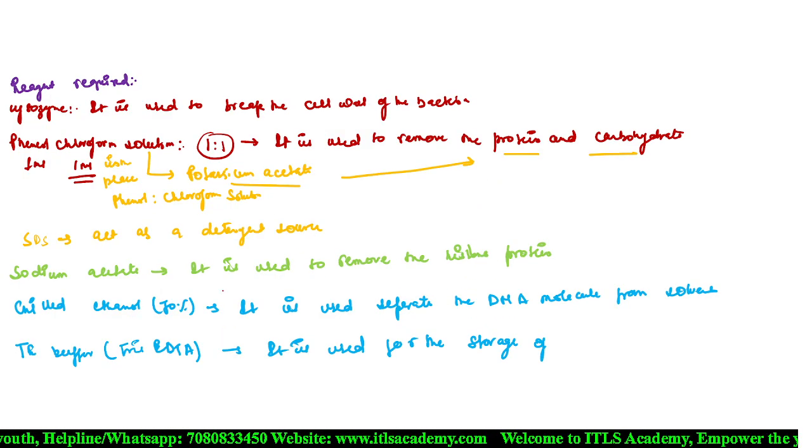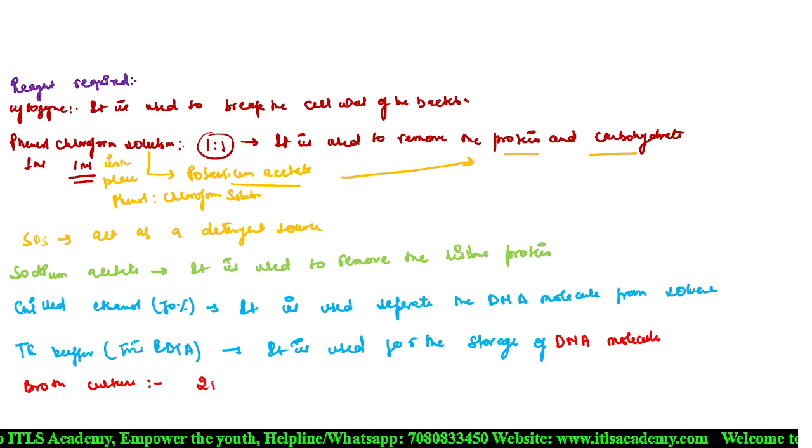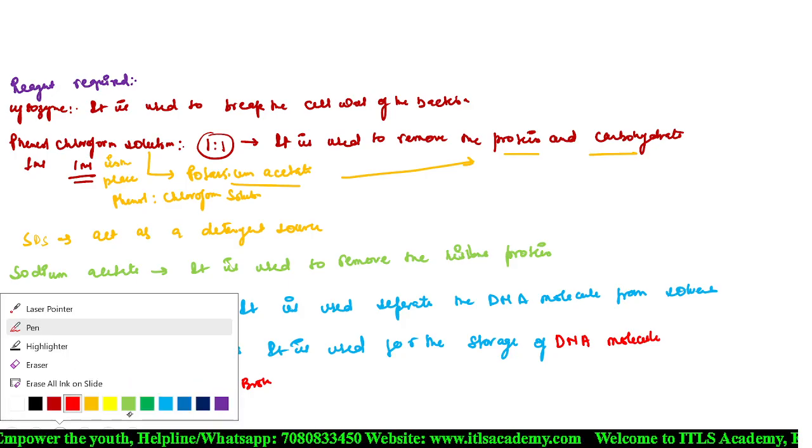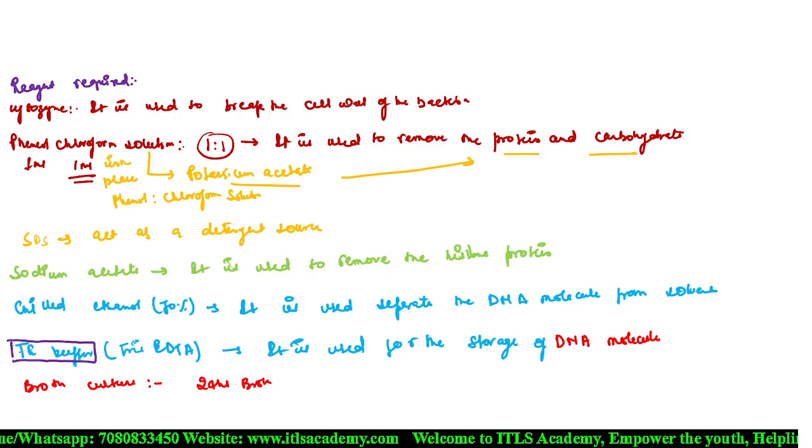Now this TE buffer is used for the storage of the DNA molecule. And we require a broth culture. And this broth culture is what? This broth culture is, at least, a 24-hour broth. Now this TE buffer is prepared from the previous one that we already prepared.